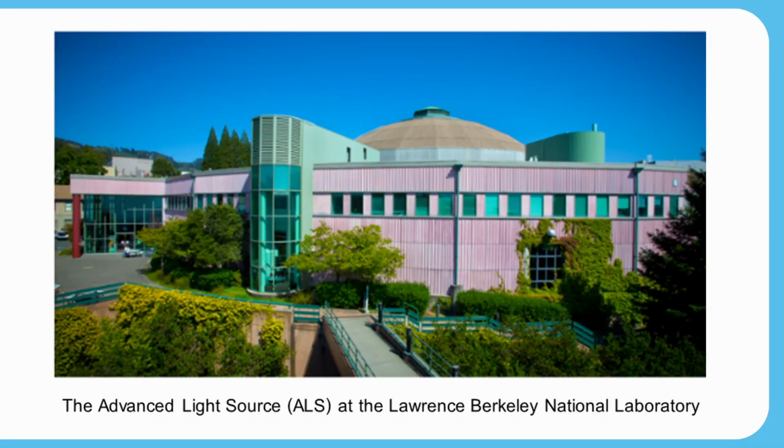These crystals were barely large enough to get some X-ray data. However, Dan packed up the crystals and drove up to the Advanced Light Source at the Lawrence Berkeley National Laboratory. The Advanced Light Source, nicknamed ALS, is a resource of the Department of Energy. ALS is a specialized particle accelerator called a synchrotron that generates bright beams of X-ray light for scientific research.